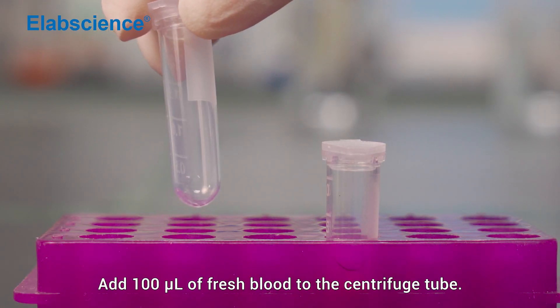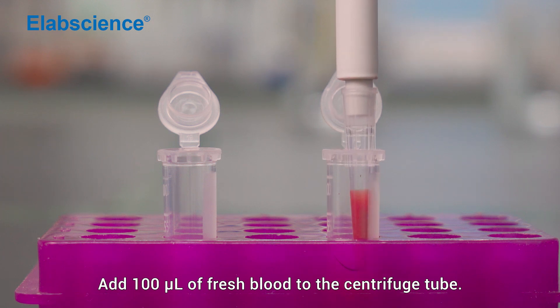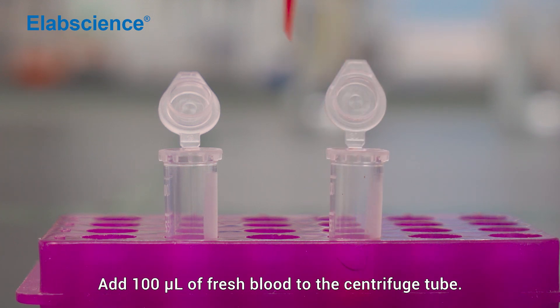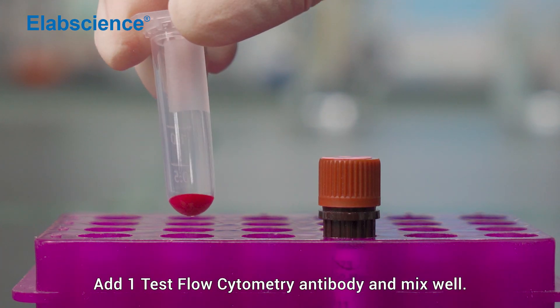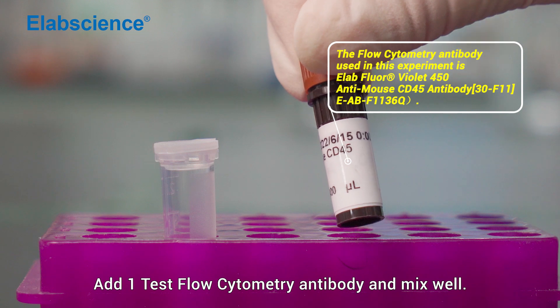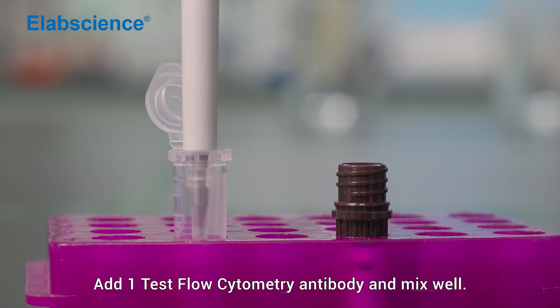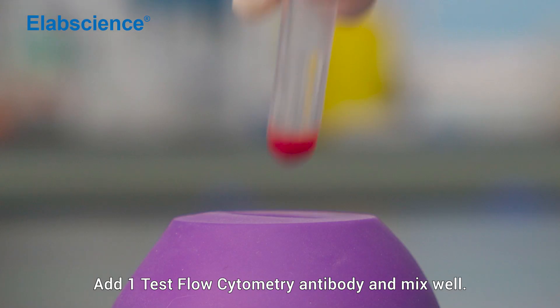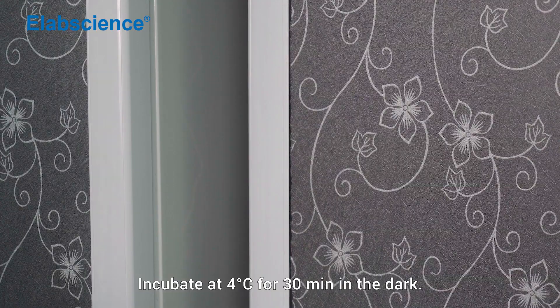Add 100 µL of fresh blood to the centrifuge tube. Add one type of flow cytometry antibody and mix well. Incubate at 4 degrees for 30 minutes in the dark.